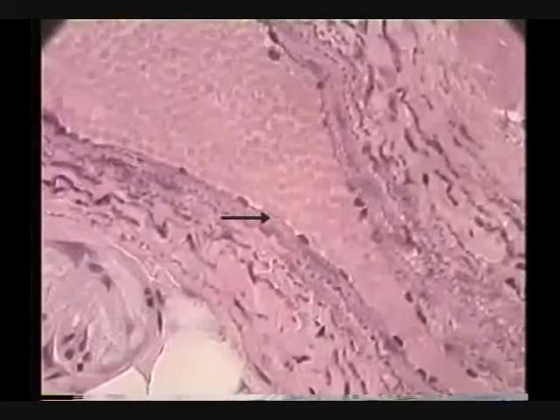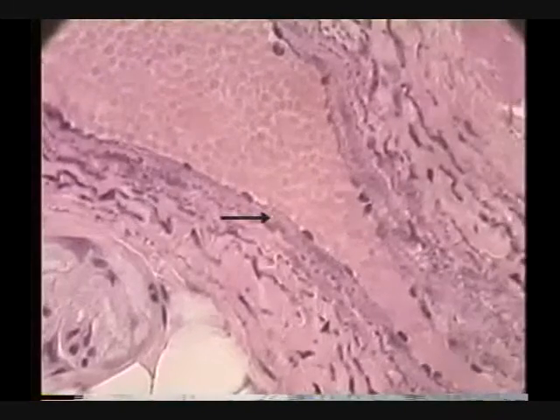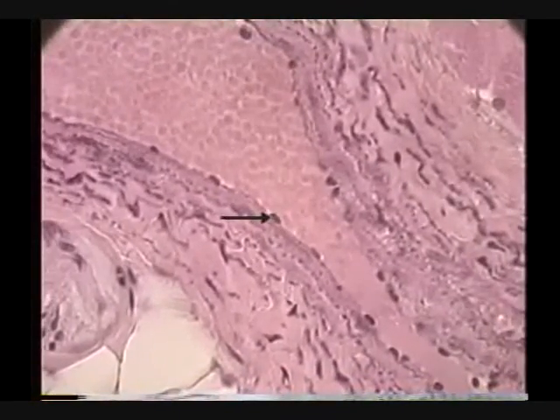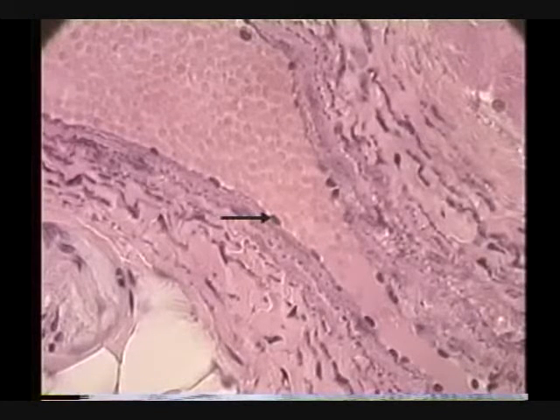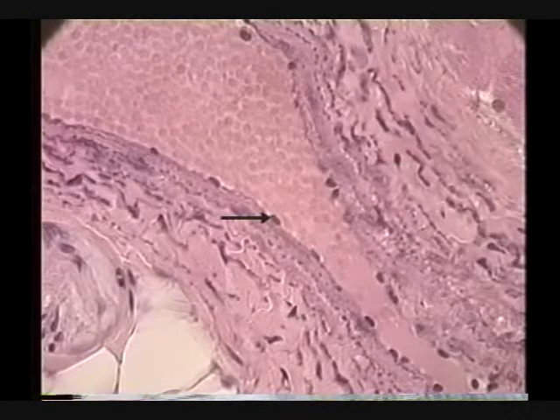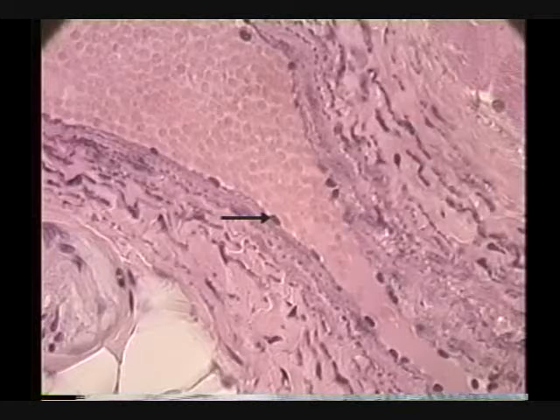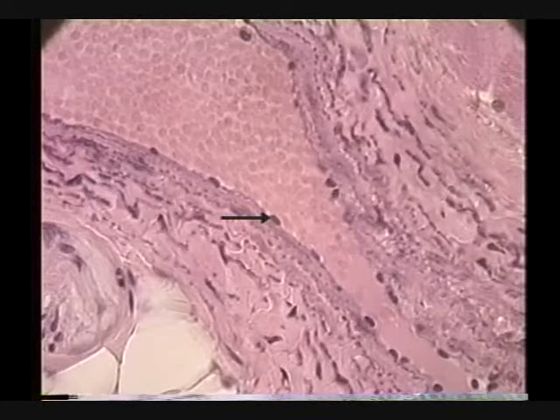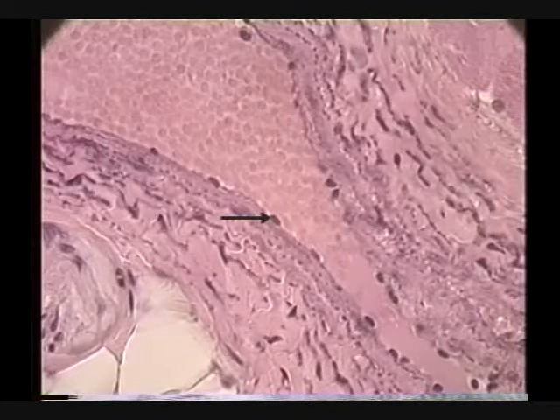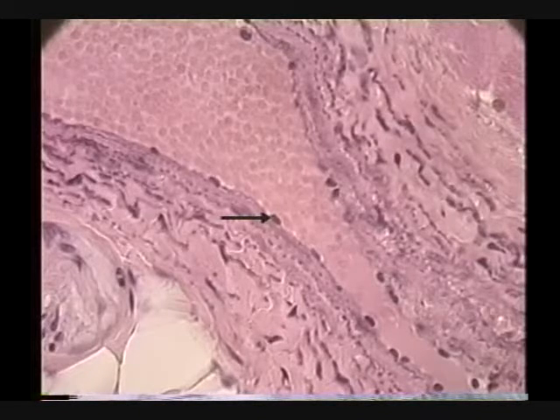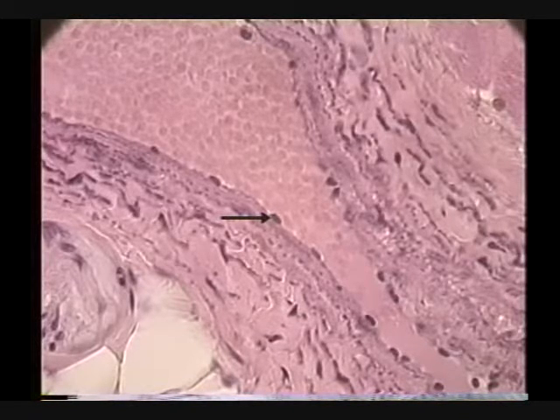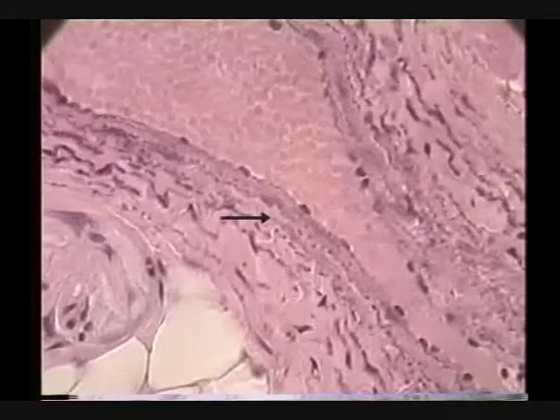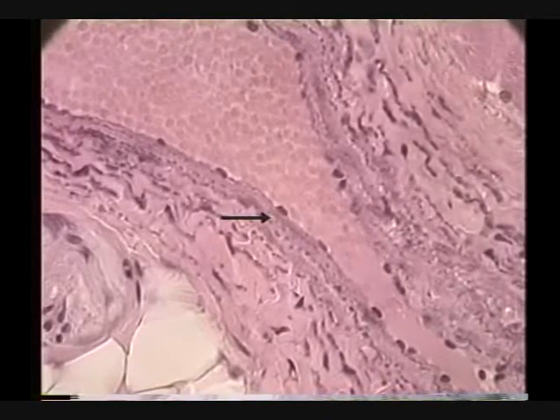Moving to higher power, we can see the nice nucleus here. That nucleus is part of what tunic? Tunica interna, also known as tunica intima. We've got this problem with multiple names - tunica intima, tunica interna. And we come out here into another tunic, a layer.